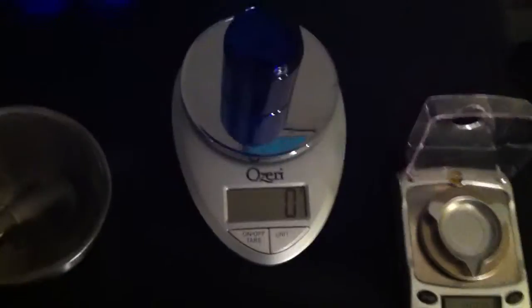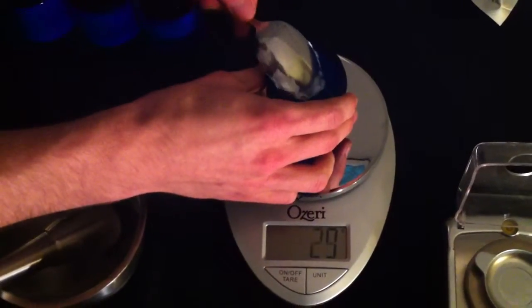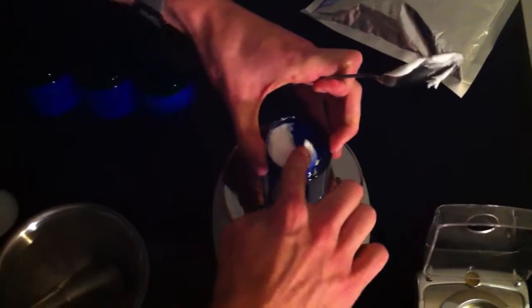I've just got an empty jar here — this is just so I can weigh out 40 grams of the cream. Twelve... twenty-one... it's almost there. Now of course this is already made up with preservatives in it as well, which is great — you don't have to be as worried. It is pretty much ready to go. Thirty-two.